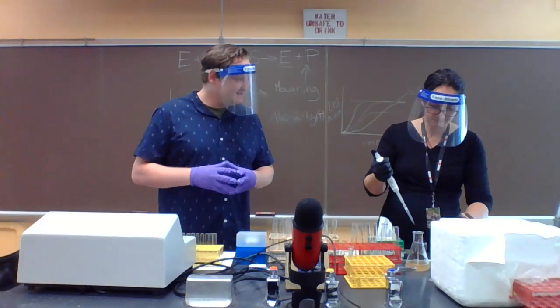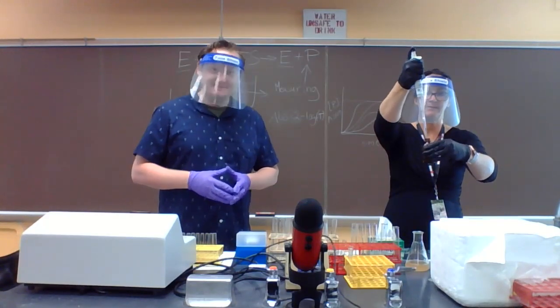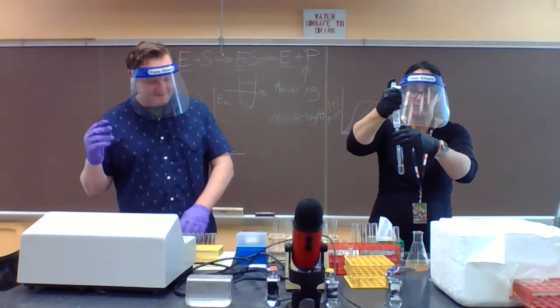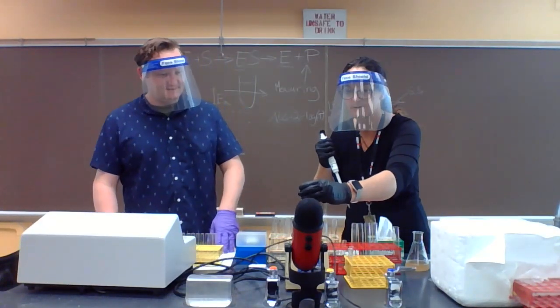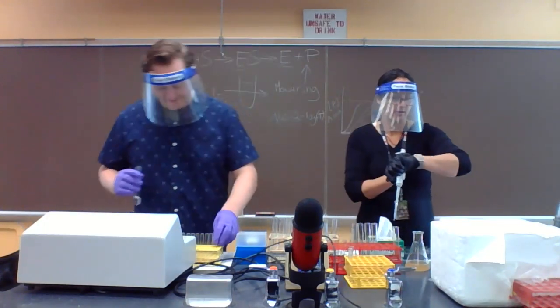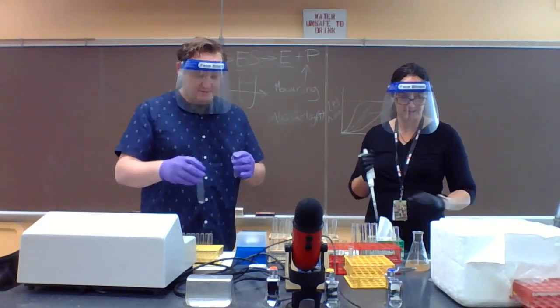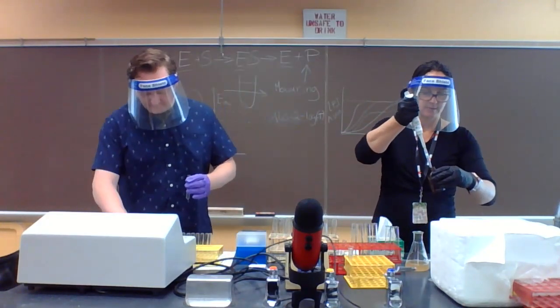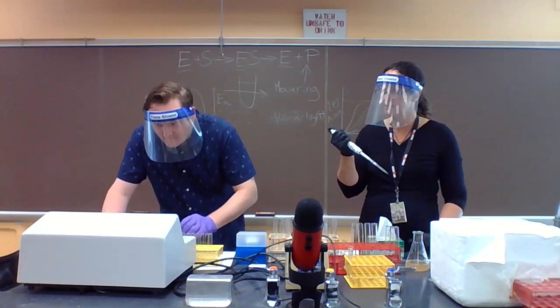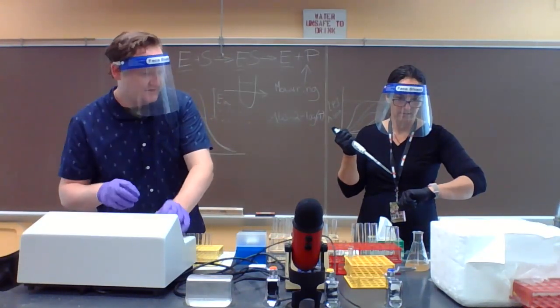And catechol is poison and it's toxic and it's nasty, so we're wearing gloves. Being careful. Give it a quick swirl. Nice. Yeah. Perfect. Okay, start the timer. All right, and then when we get to exactly 1 minute, I'm going to add to tube number 2. Okay. Value there.